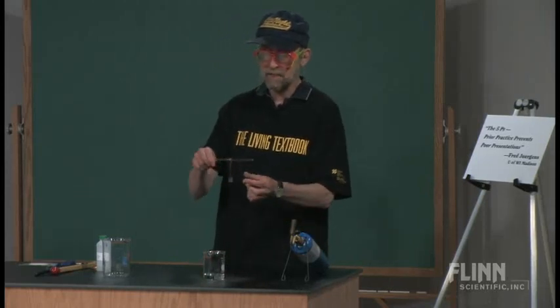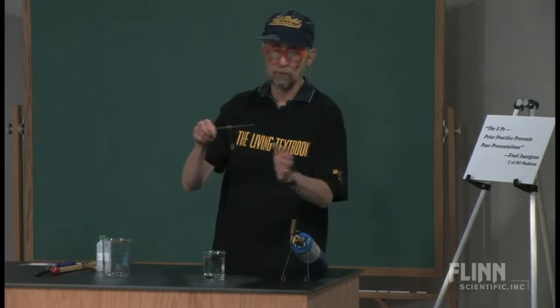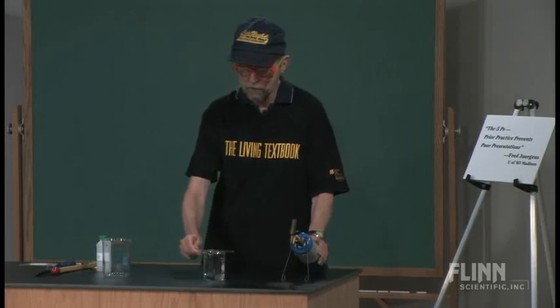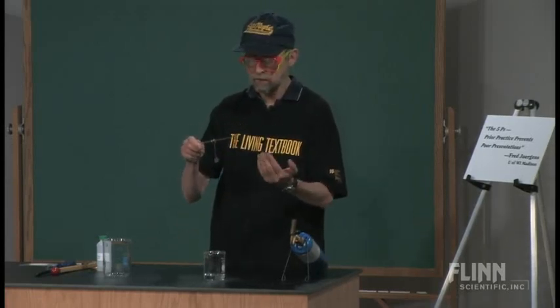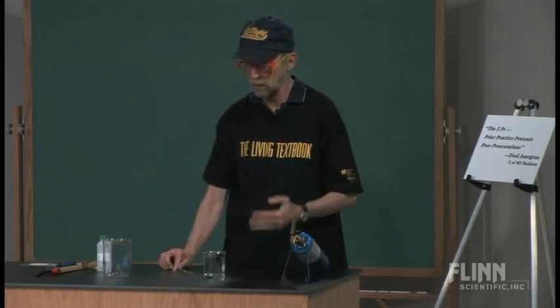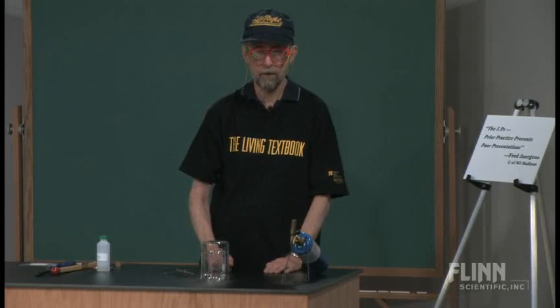Now we're going to heat the penny red-hot with this torch. We'll put it back over the acetone so the vapors waft across, and what you see will be interesting. Some of you are thinking: that's flammable acetone — what if it catches fire? Well, it could. I've never had that happen, but if it does, that's what this cover beaker is for. You simply cover it.